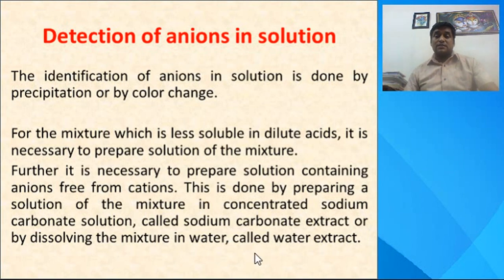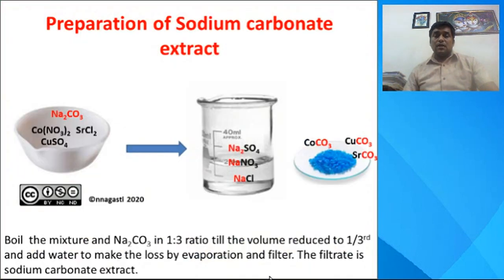This water extract or sodium carbonate extract, which are in solution form, we can use for testing individual anions with their confirmatory tests. Let us understand how to prepare this sodium carbonate extract, why to prepare it, and how it helps in separating anions from cations.